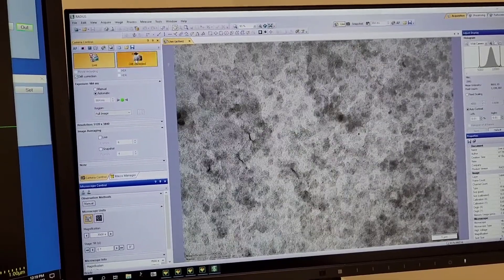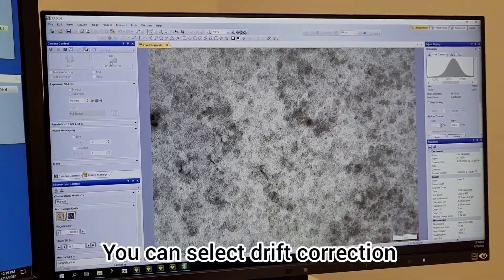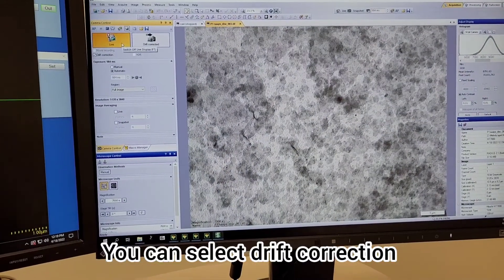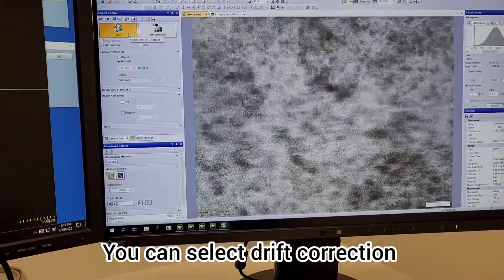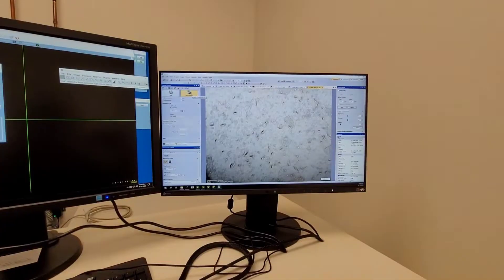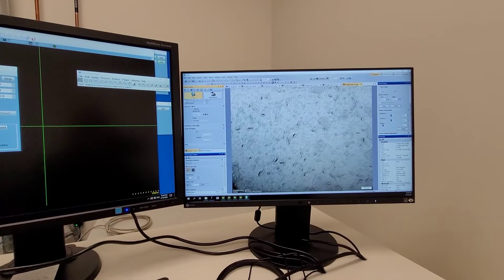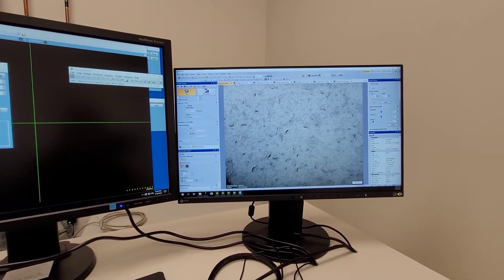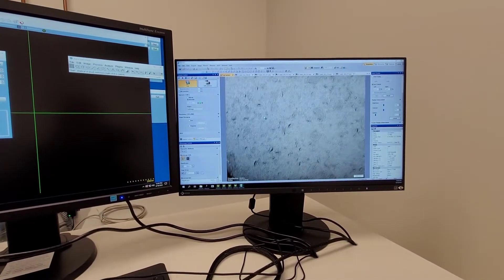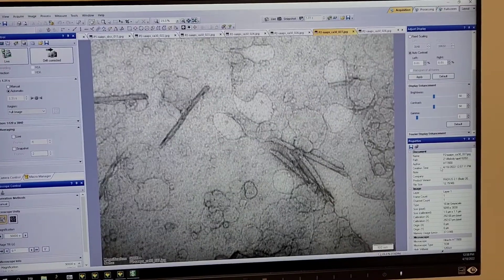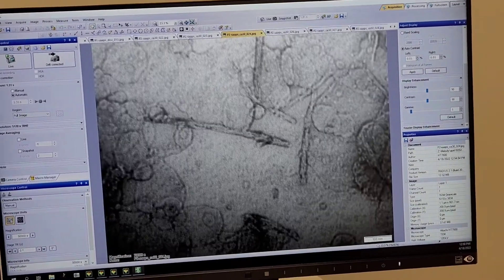To take a picture, I'm going to turn on the drift correction and take a snapshot. These are some of the interesting objects and particles that I was able to see that day.